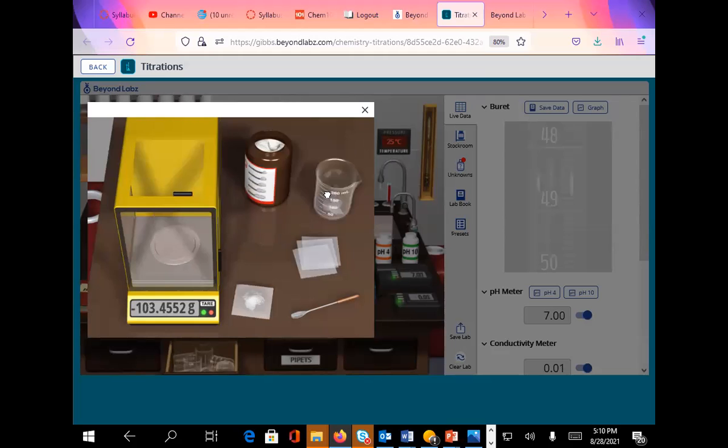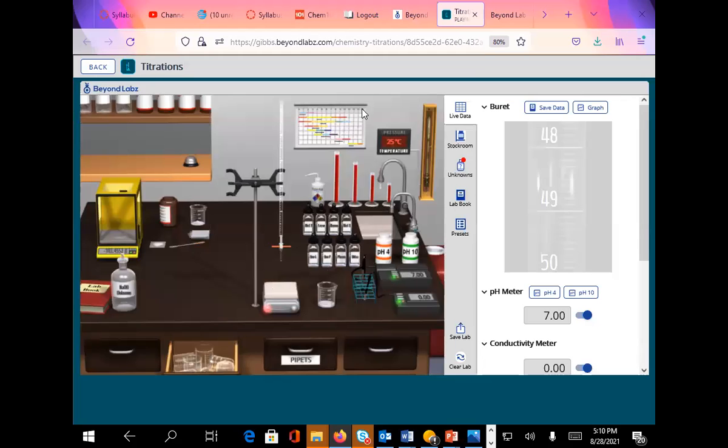So we can pull our beaker back out, we can close this, and then we are now going to drag the beaker to the sink and hold it underneath the water and get some water into the beaker. Oh, that's plenty. Okay. We put it here on our stirring plate. It says to drag the calibrated pH meter to the beaker.